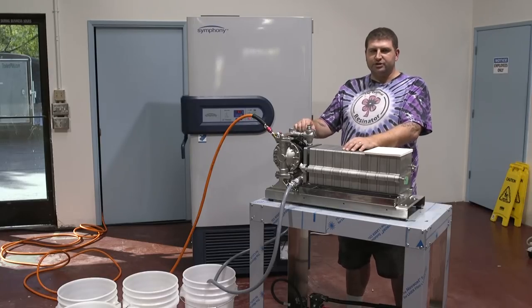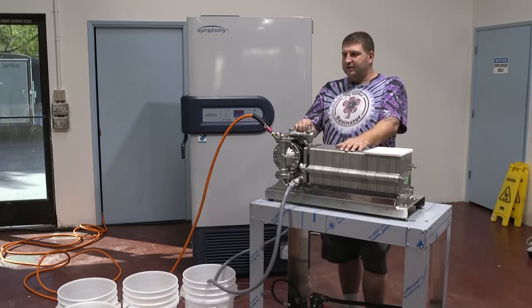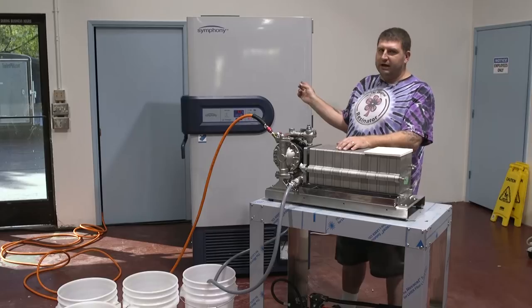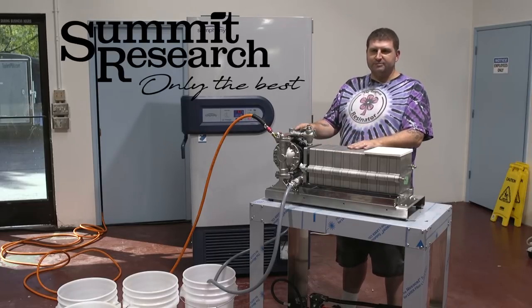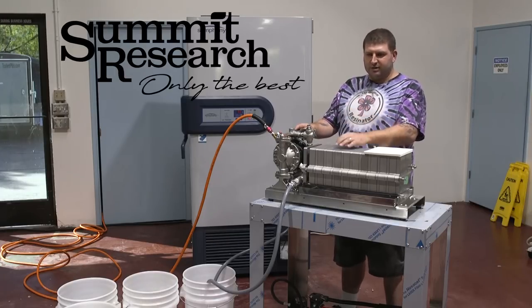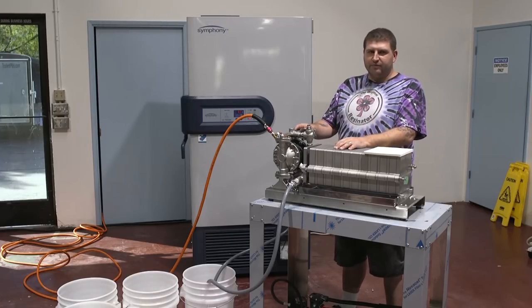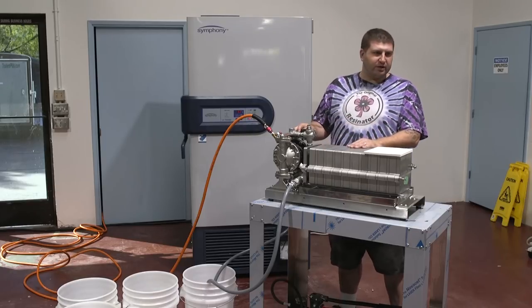The procedure for doing this is resetting the system, and then we have to pull cold ethanol out of the deep freeze and cycle it through the system to bring the temperature down so it doesn't act as a heat sink and warm things up. Then we're going to flush it out with fresh, clean, cold alcohol to get all the oils out of your waxes and lipids. We'll start now with assembling the unit and preparing it.